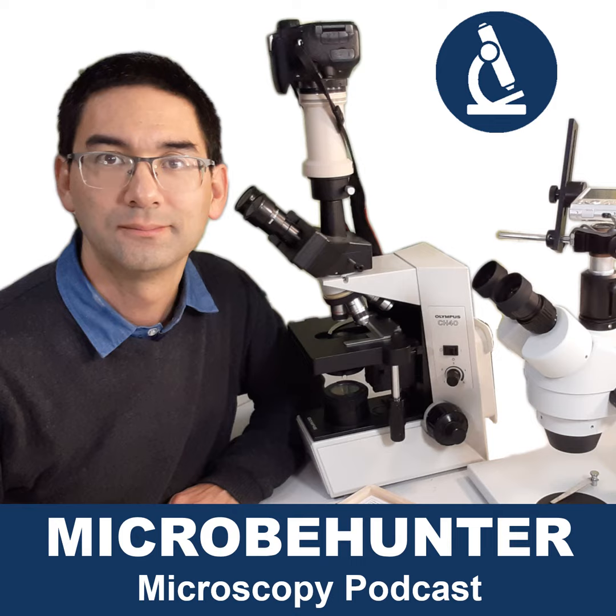Well, of course, one of the advantages is you don't have to look through the eyepieces. So if you have problems looking through the eyepiece, then it's simply more convenient to look at a computer screen, because it's just standing next to you, and then you can take a picture using the computer and you can do certain measurements if you need to. That is a very clear advantage, maybe especially for long-term use. If you are spending many hours behind the microscope, it can be a little bit easier on the eyes to use a computer screen than having to look through the eyepieces. I don't know, it's maybe to a certain extent a question of taste, but in any case it's very common to connect a laptop to a microscope.